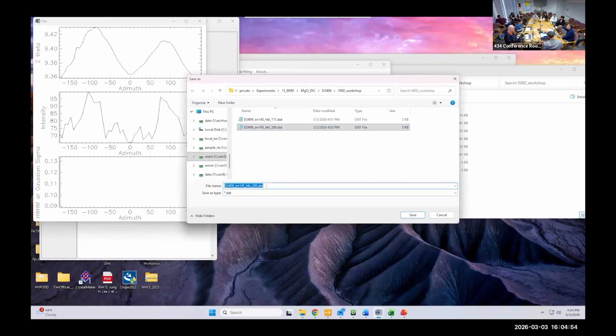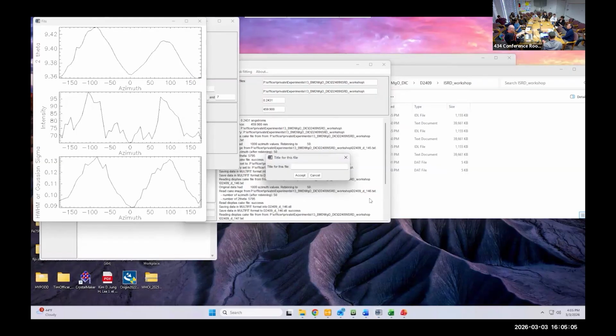But it's a possibility because as you heat the sample up, the hutch temperature goes up. Everything we have in there is at least 1.5 meters tall, and a 1 degree temperature fluctuation would make the whole thing drift out slightly, and then your center will be off. This was at room temperature, so it doesn't matter.